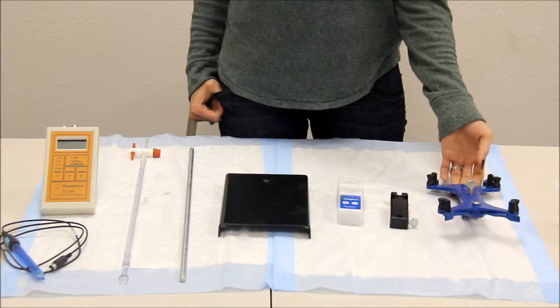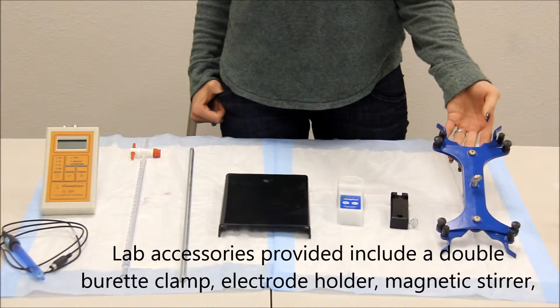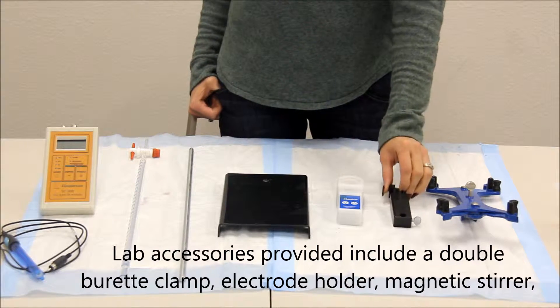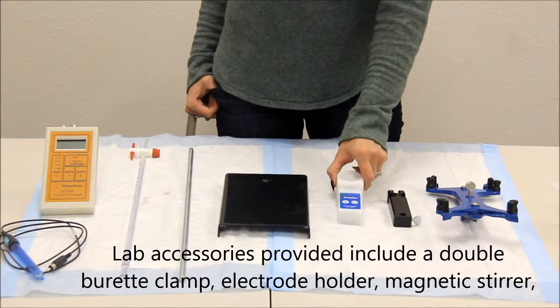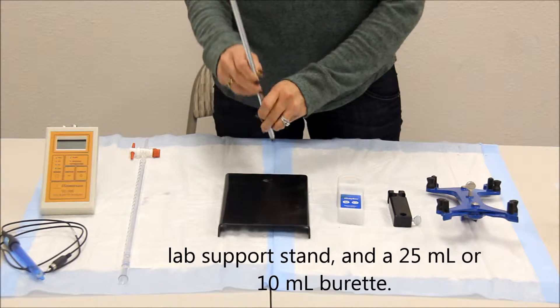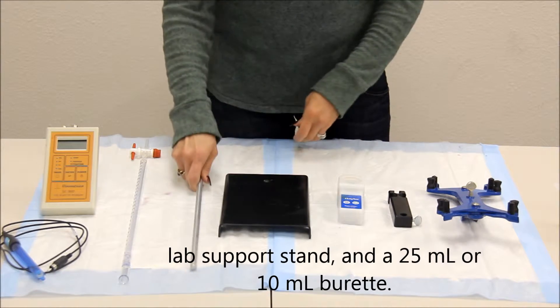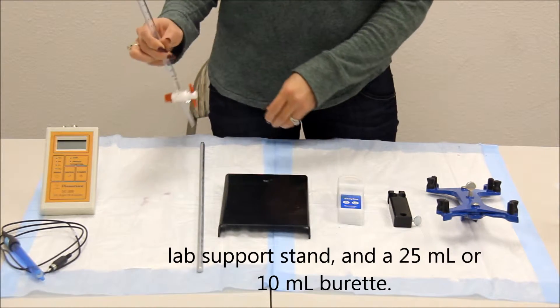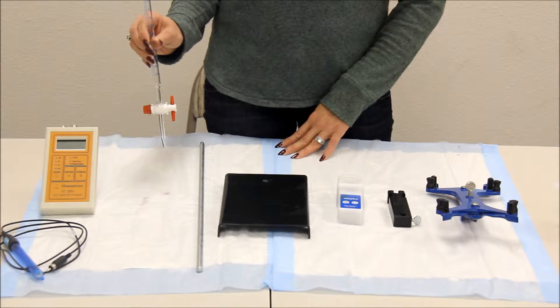Both kits come with the double burette clamp, electrode holder, magnetic stirrer, lab stand, and they will come with either a 25 or 10 mil burette.